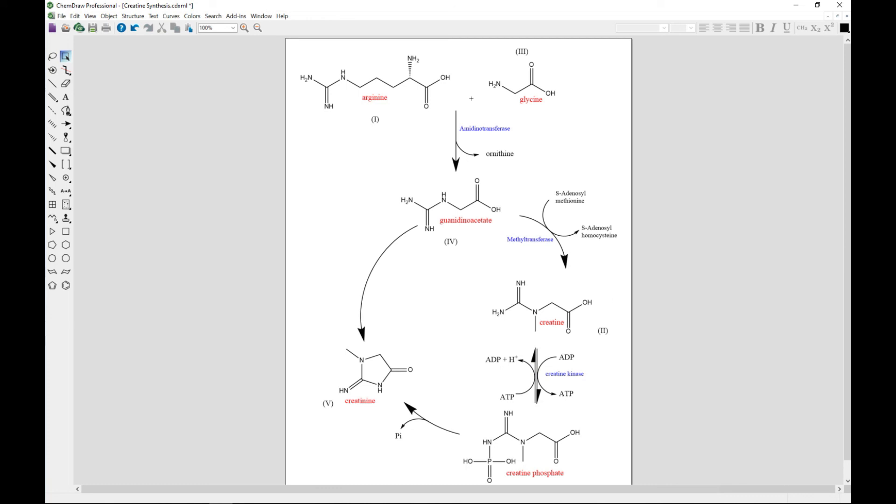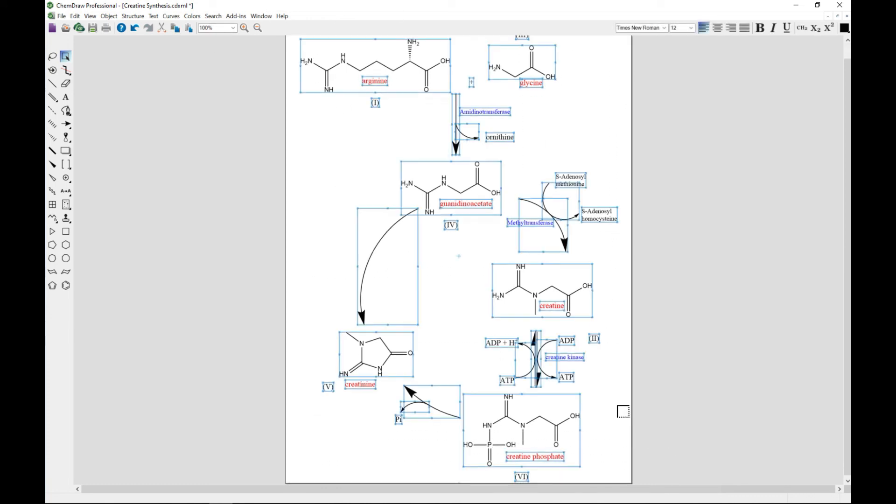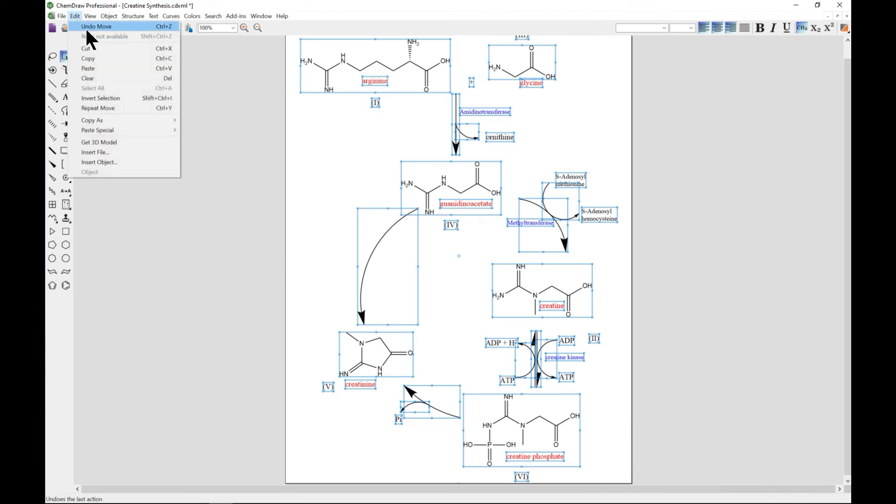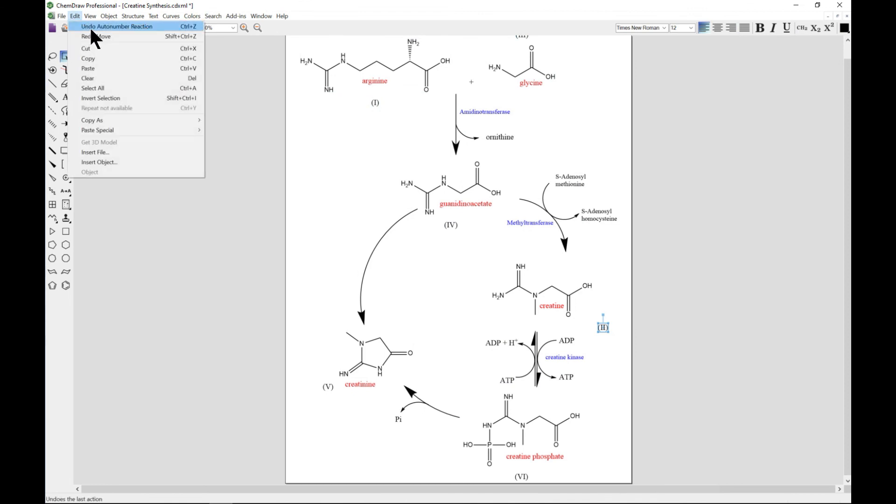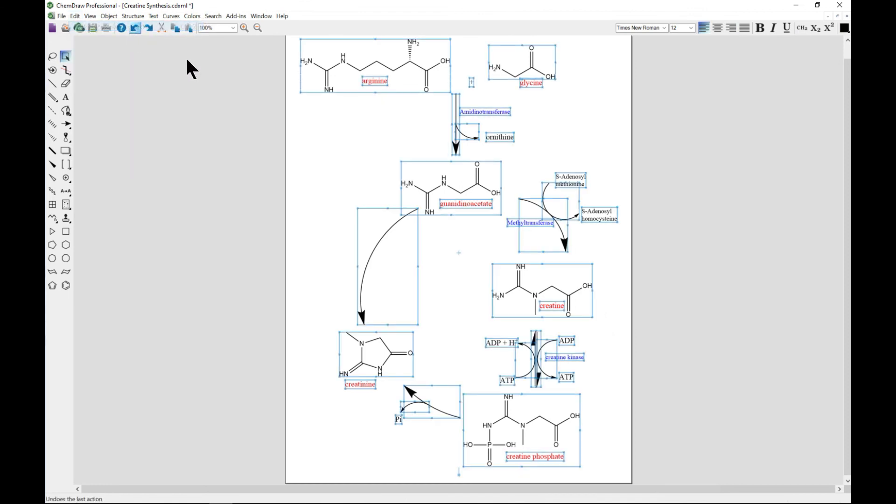If you want to remove it all, you can also select again. This time go to Edit and Undo Auto Number Reaction, and it goes away.